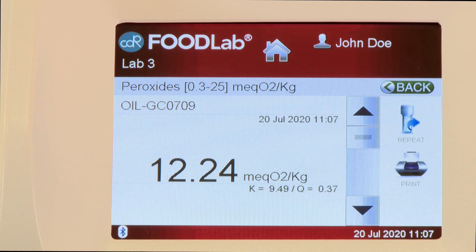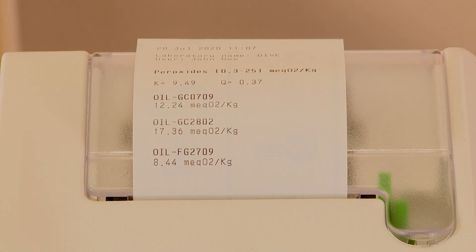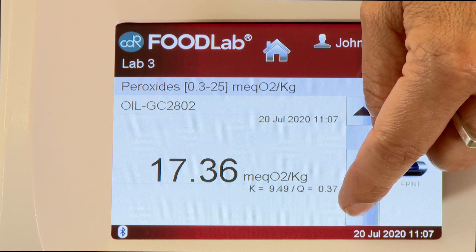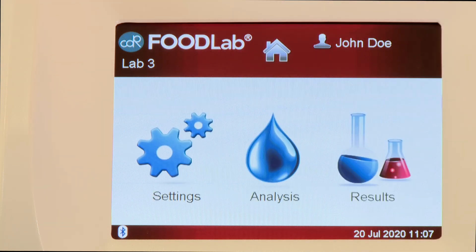At the end of the last reading, the result for the first sample is displayed, and all the session results are printed. You can scroll down on the screen to see all other results of the reading session. Press Home to return to the main menu.